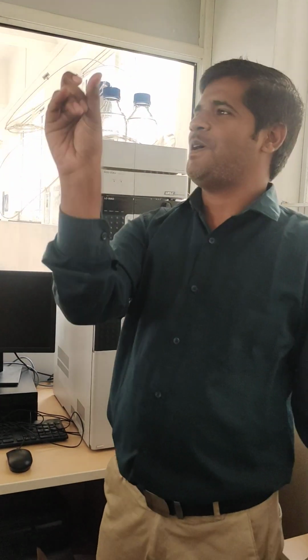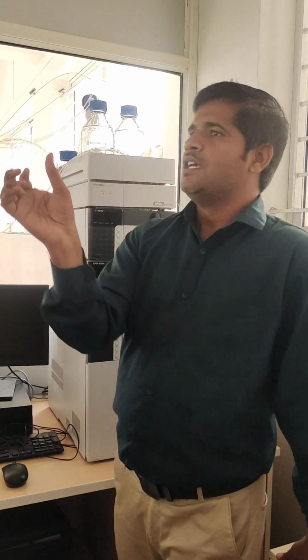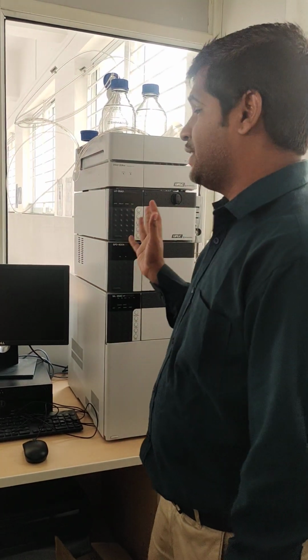So we can separate ibuprofen and paracetamol, and we check the concentration of each on the basis of area. Means we determine the concentration of paracetamol as well as ibuprofen in the mixture. Already we have separated them with the help of this method. The retention time of ibuprofen is different, and the retention time of paracetamol is also different. That is the main concept.